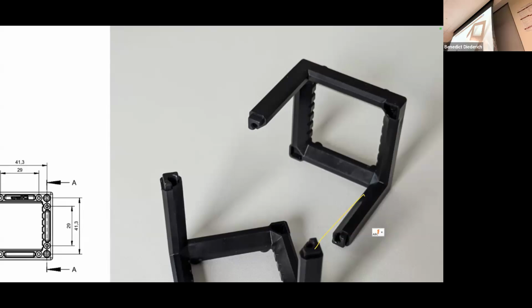Since we have forth and back, this is actually 650 divided by 4. So you can measure the distance shift from black to white at about 120 nanometers. When you move this mirror here by 120 nanometers, you already see something changing from black to white. That means 120 nanometers is very, very little. Your hair is, I think, in the range of 100 microns. That's 3 orders of magnitude more.